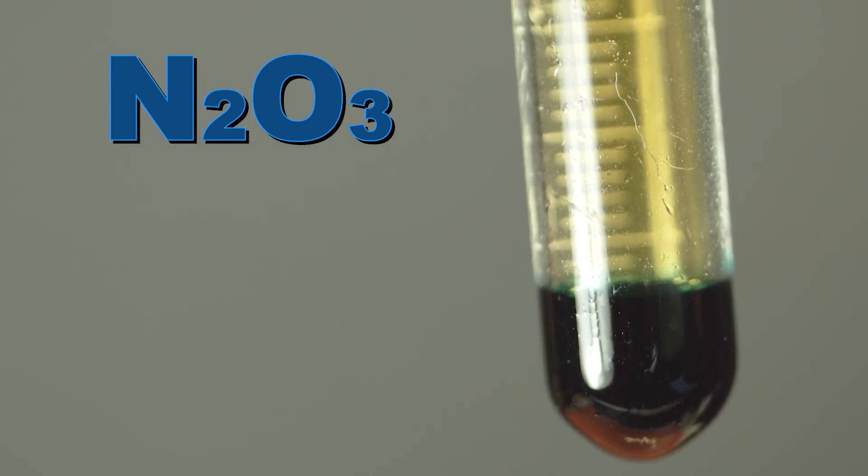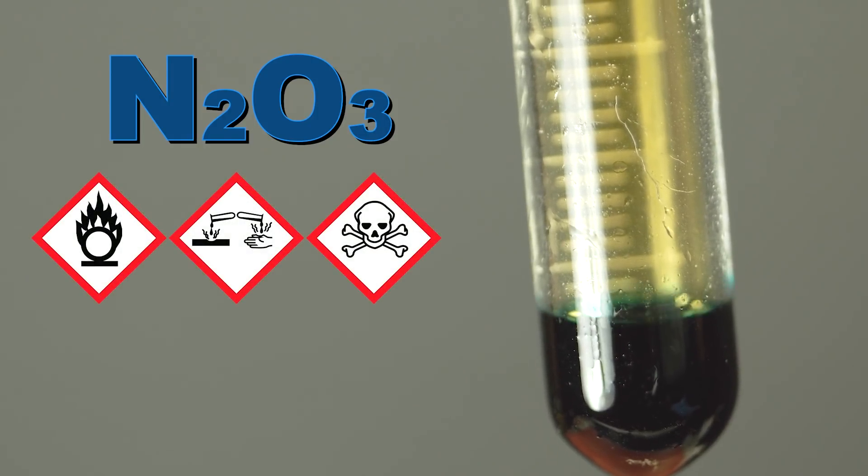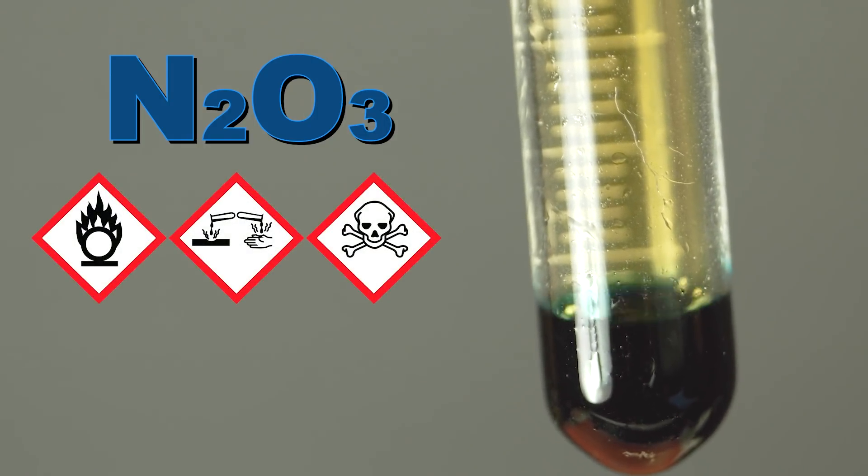So I decided to pour dinitrogen trioxide onto burning samarium. Dinitrogen trioxide is a blue-colored liquid that is in fact nitrous acid anhydride, quickly evaporating into nitrogen monoxide and dioxide at room temperature.